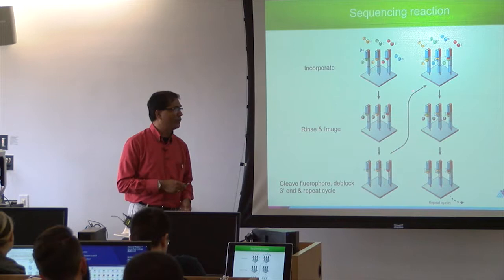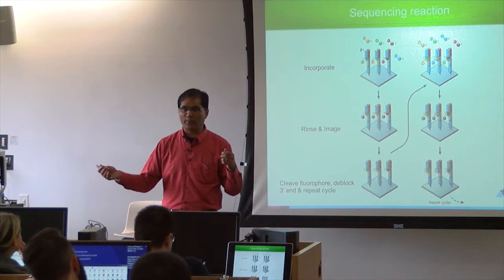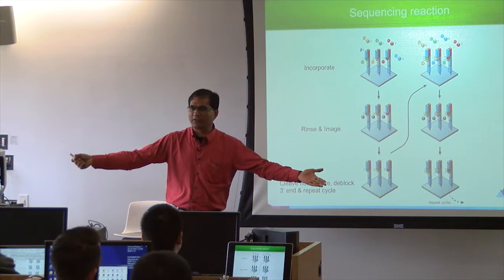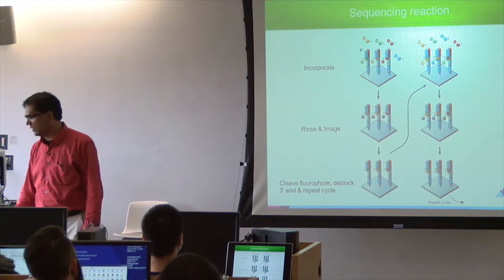There you can add to all the wells. But simultaneously, the well is also a limitation. Now you remove the limitation of adding one base at a time and sequencing partial wells. Now you can sequence in all the wells. But the wells themselves are the limitation. You can't go beyond 1 or 2 million. You want to go to 10, 15, 20, 50, 100 million. You want to go maximum. There shouldn't be any limit. You have to get rid of these wells somehow, right?